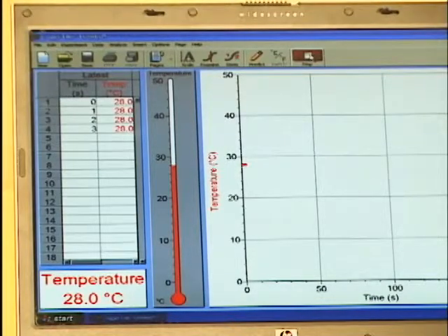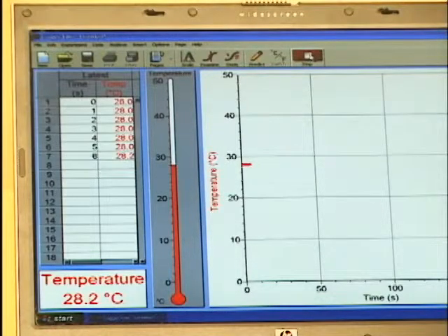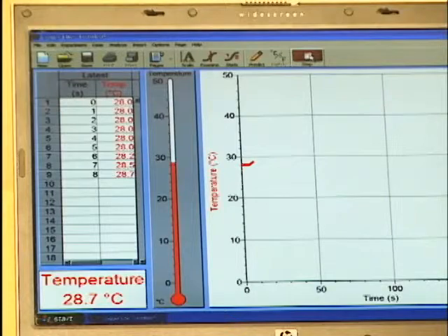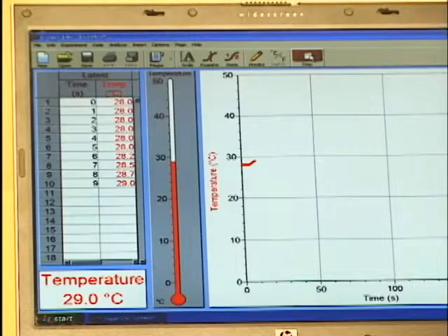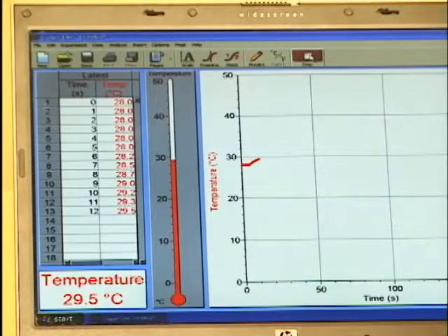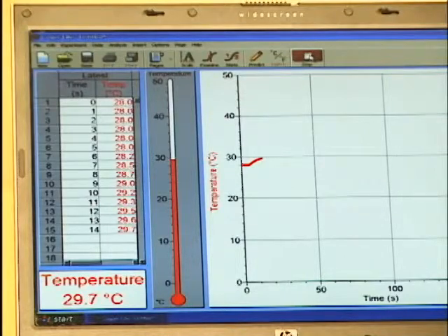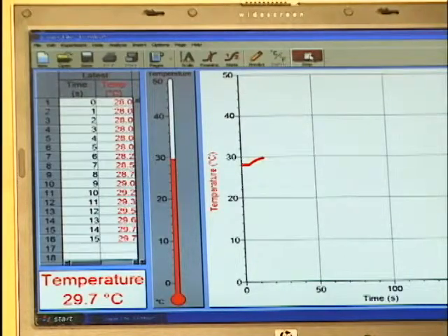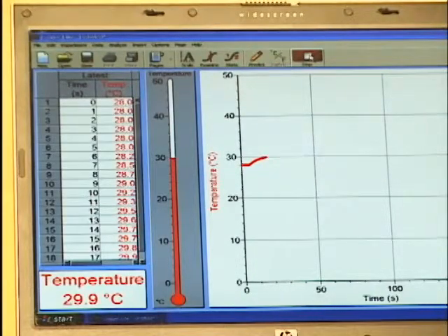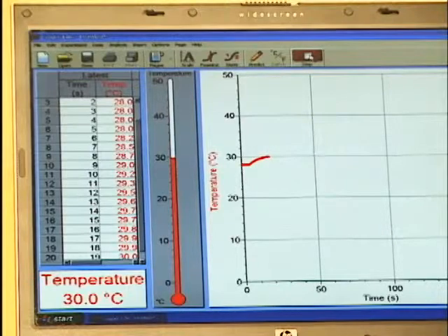We'll hold onto the temperature sensor and start seeing the data change. You'll notice the data is represented in a number of different ways: a graph window, a data table, a digital meter, and a graphical meter.